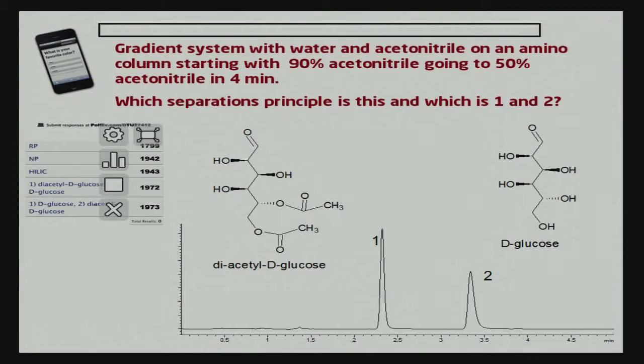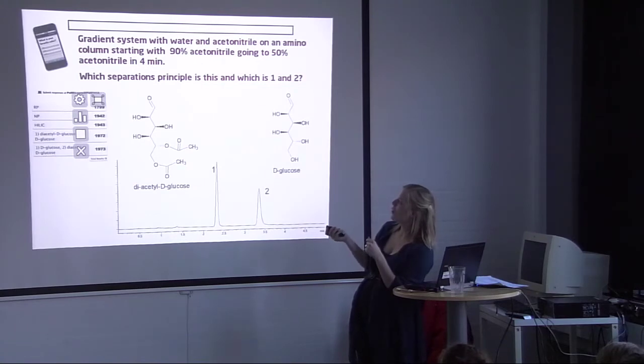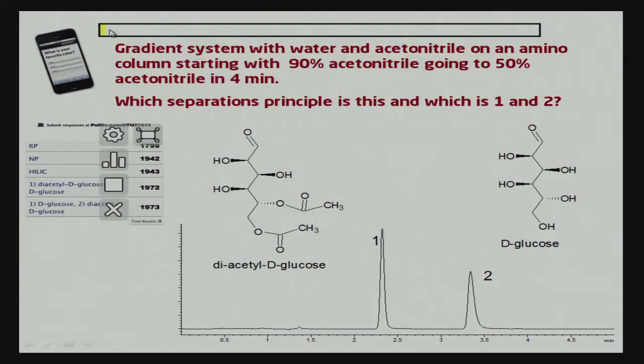Which of these, diacetyl glucose and glucose, is peak number one and peak number two? So from the text up there, see if you can recognize the type of chromatography and then figure out whether the apolar or the polar analog of glucose will come out first. If you don't see the question on your computer, try refreshing the browser. I don't know how quickly it updates. And again, you can just ignore the second part of the question.